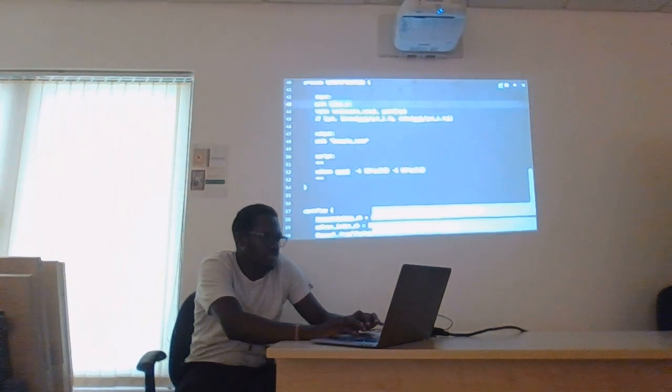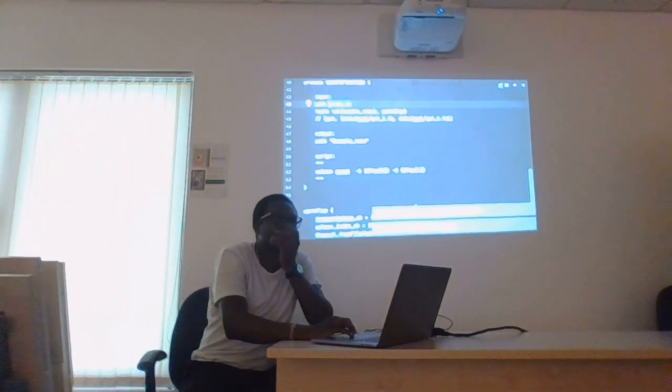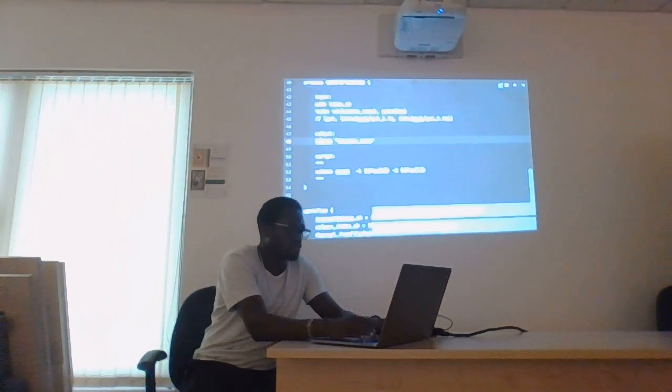These names can change, but the keywords for Nextflow, like path, tuple, val, they have to be there, depending on the channel that you are working with. Okay. And if you would have formed a different type of channel and want to capture the sample ID here, you would still do a tuple val and then sample name, and then the path to your output here, which you would name accordingly as well.